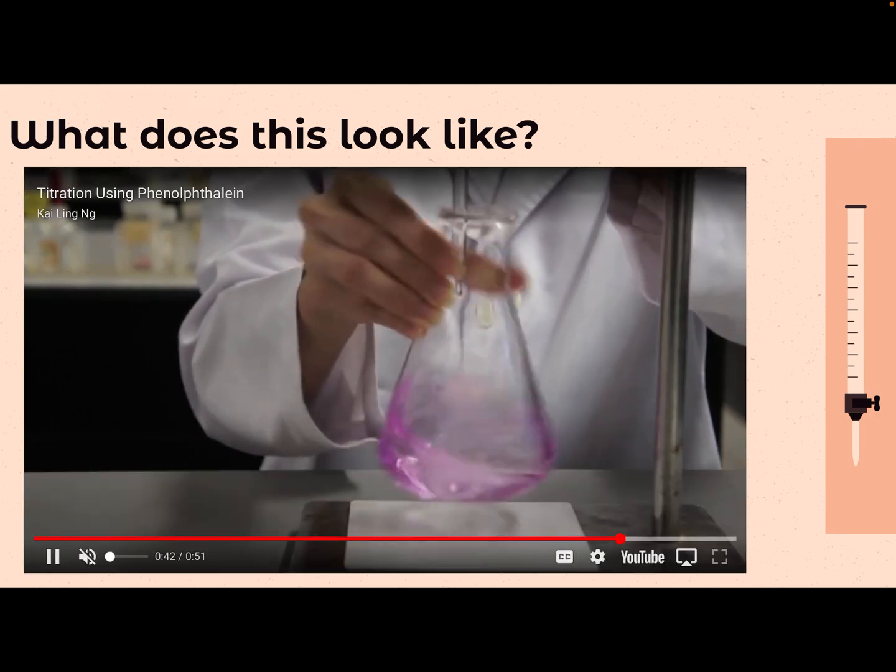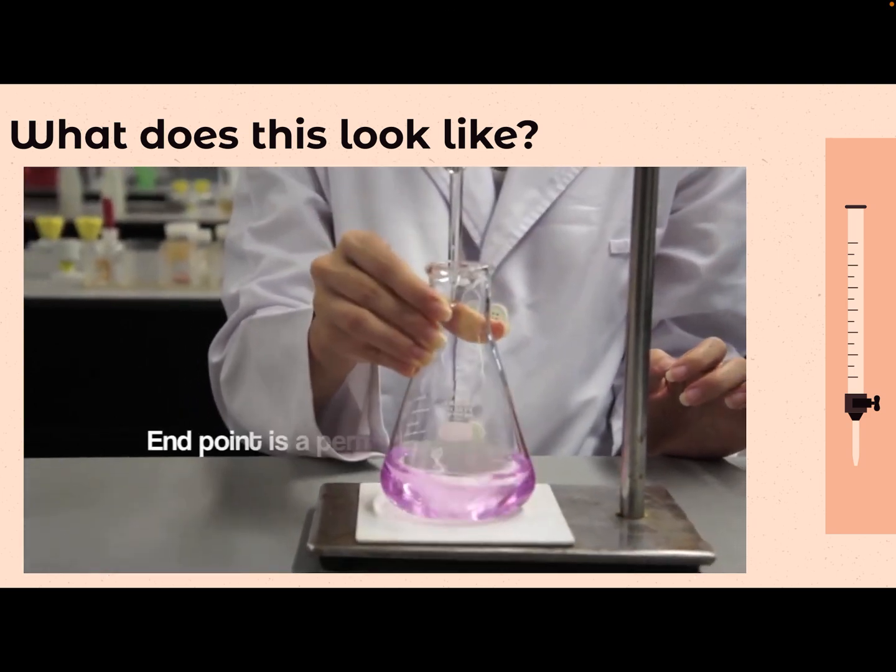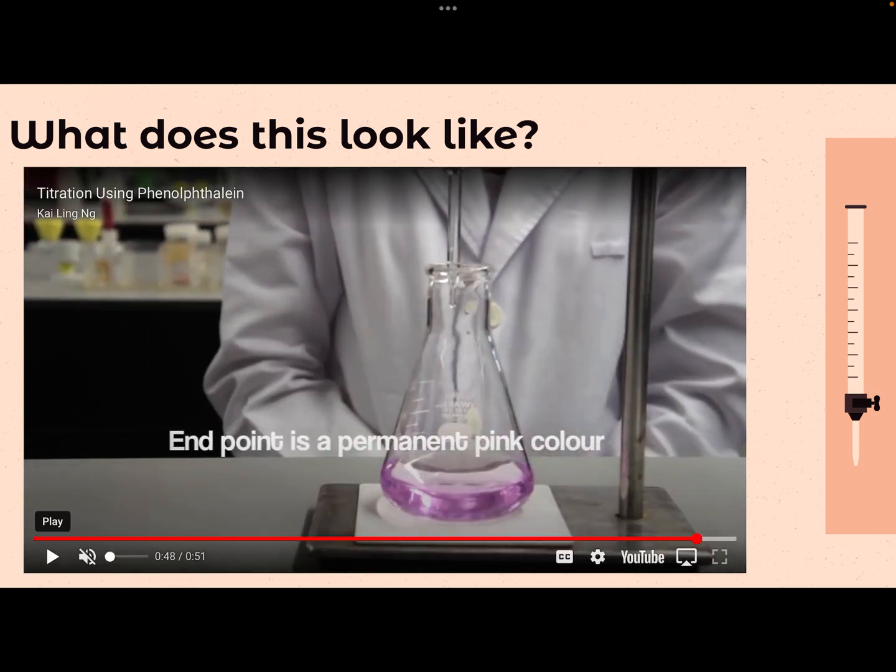Then, as soon as you're about to hit your endpoint, you add in one more drop. If you add in that last drop and your pink color persists and doesn't go back to colorless, you have now reached the end point of your titration. So you're looking for that very, very light pink color that she's got in the video here. This is now signaling the end point of your titration.